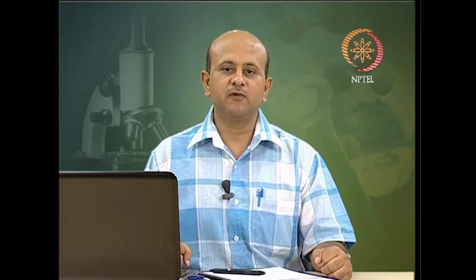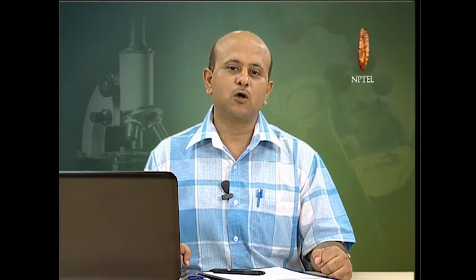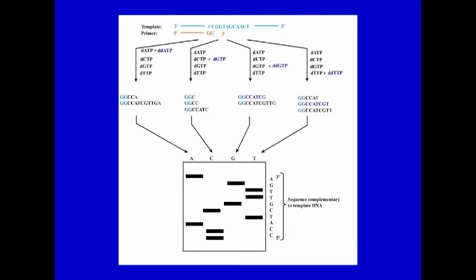One variant of the double stranded approach often employed in automated sequencing is cycle sequencing. This involves a linear amplification of the sequencing reaction using, say, 25 cycles of denaturation, annealing of a specific primer to one strand only, and extension in the presence of Taq DNA polymerase plus labeled dideoxynucleotides. Alternatively, labeled primers can be used with unlabeled dideoxynucleotides. So, this schematic shows this particular method.